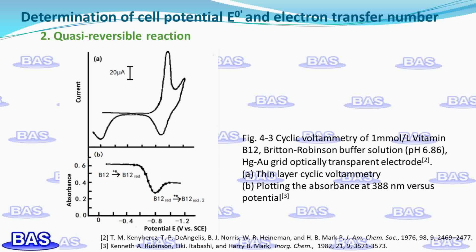optical response signal can be observed even if the Faraday current response is completely masked by the residual current. A typical example of this type of system is the vitamin B12 mentioned in Chapter 1, where the rate of electron transfer in the first electron reduction step is rather slow. The reduction wave is barely observed below the slow sweep used in DC polarography until the potential is sufficiently negative to produce a 2-electron reduction wave. Figure 4.3 shows the cyclic voltammogram for its negative potential sweep.